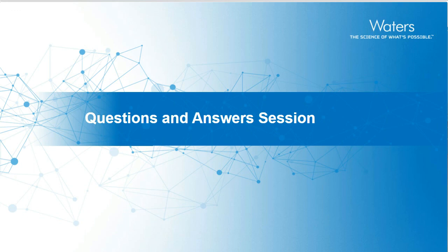It's got SmartMS. As I mentioned already, the system upon startup does go through the process of checking calibration and resolution. If it's happy with that, it'll obviously allow you to go forward and perform the analysis. If it's not, then it will basically flag up to say one or both need to be redone.